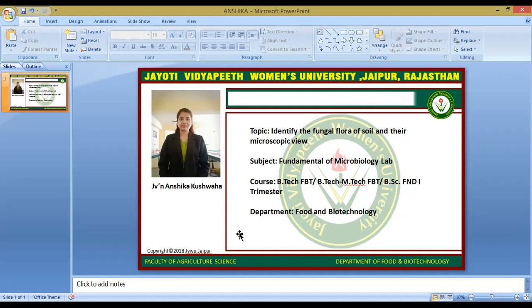For this procedure, we require several things: a soil sample, glass rod, soil mixture, distilled water, 10 test tubes, 10 petri plates, nutrient media, spreader, beaker, and two 100 ml conical flasks.